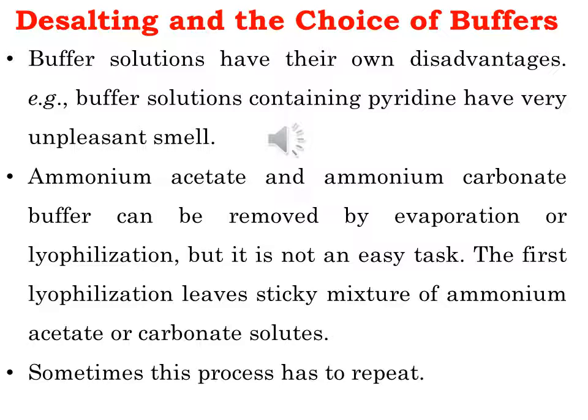So the majority of the buffer solutions that have been utilized for the separation of water-soluble natural compounds contain pyridine, and all of you know that pyridine has a very foul smell that cannot be tolerated in a closed room. So this is a main problem during the isolation, purification or extraction of water-soluble natural products.